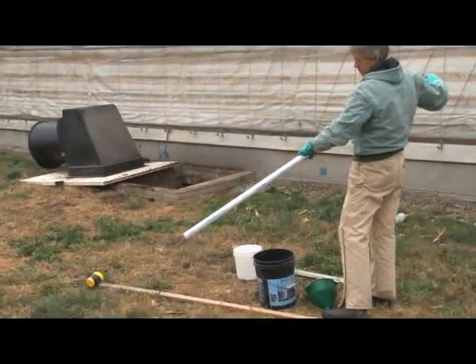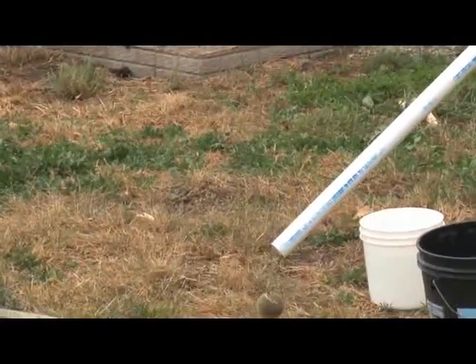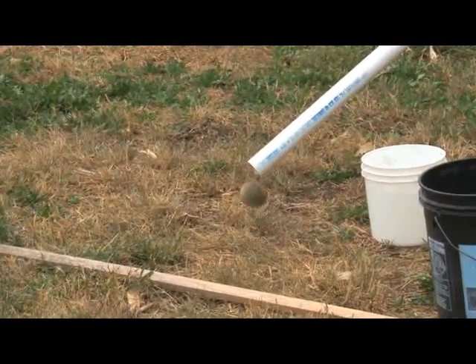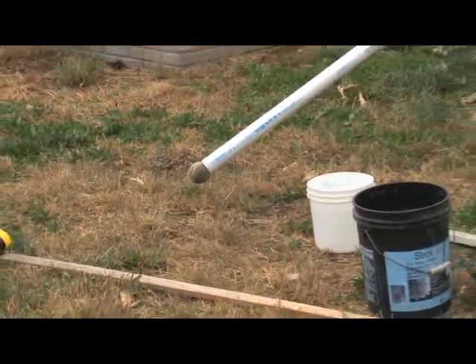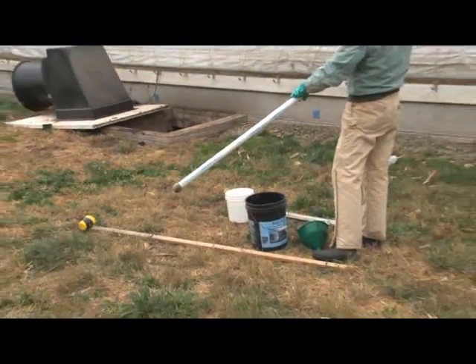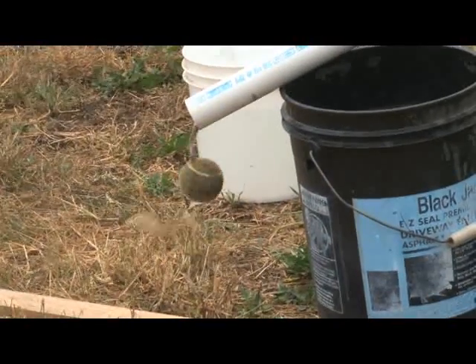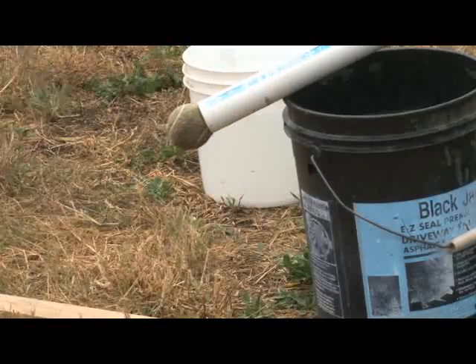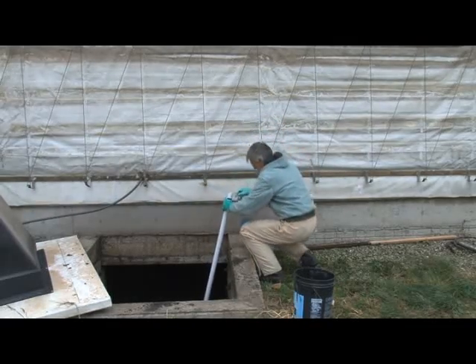Another way to take a liquid manure sample is to use a core sampler. The core sampler allows you to obtain a sample that best represents the manure from top to bottom throughout the pit, capturing any stratification, especially with phosphorus. The sampler is made using 1.5" PVC pipe with a tennis ball attached to a rope that plugs the end after taking a sample. There are commercial samplers that can be used also.